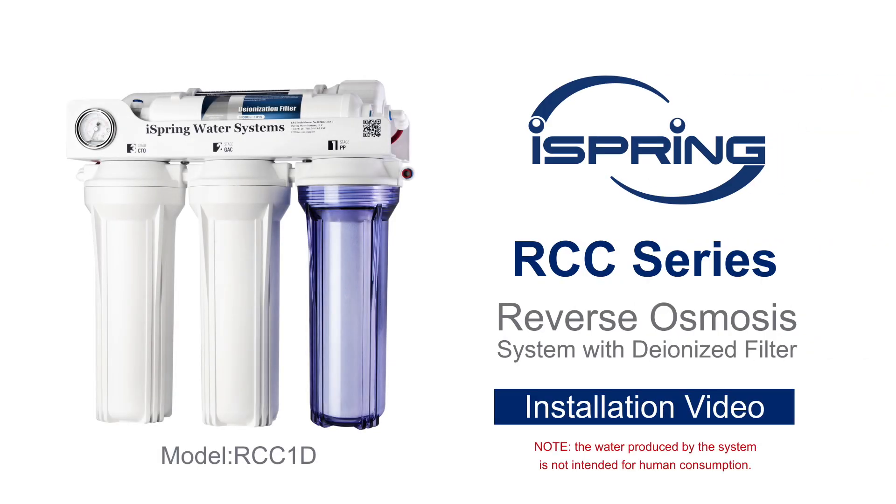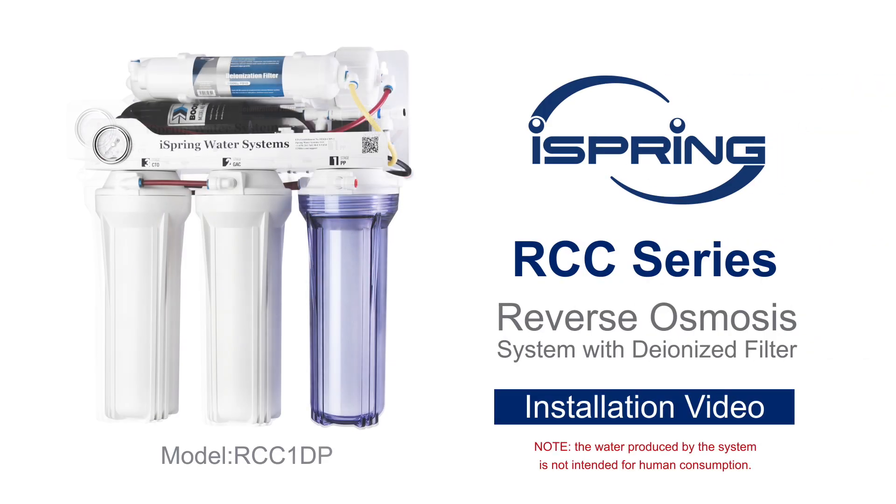Thank you for choosing the iSpring RCC Series Reverse Osmosis System with Deionized Filter. With proper installation and maintenance, this water filtration system will provide you with deionized water for years to come. Please follow the instructions in the video for the proper installation procedures. Please know that the water produced by the system is not intended for human consumption.